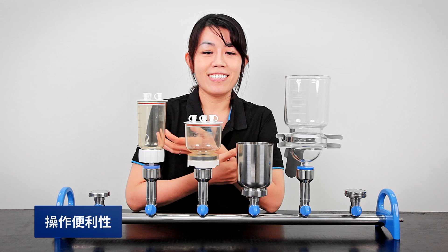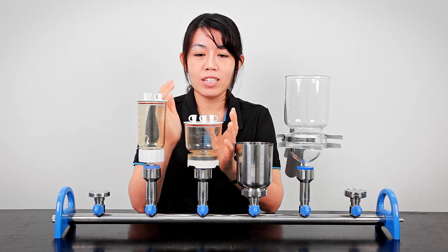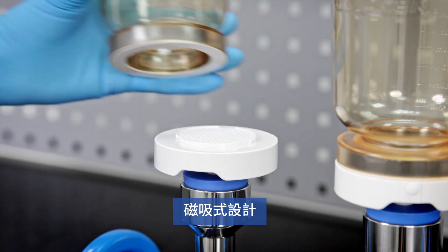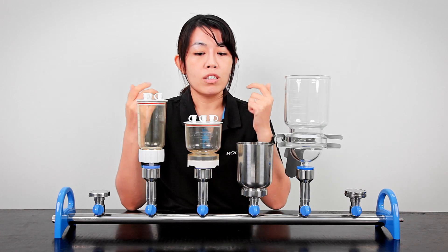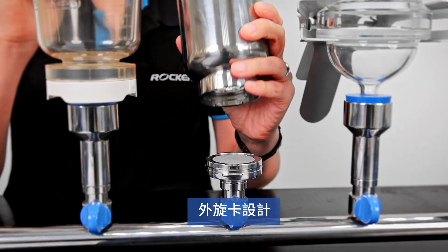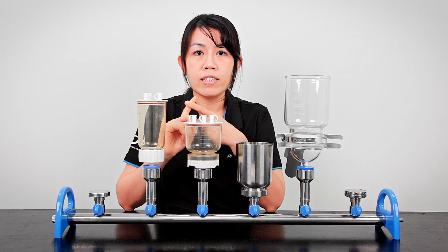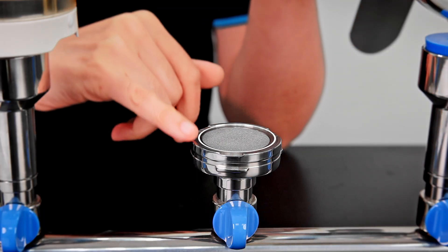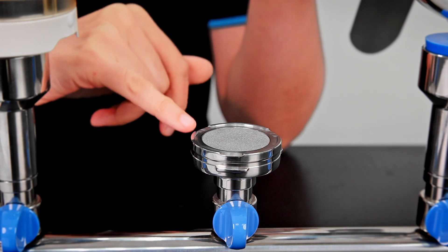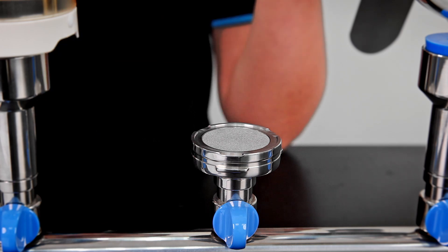Last but not least, handiness — which is a bit subjective. For me, the first place definitely goes to the MF collection. As you can see, you can take it out very easily, replace the filters, and put it back — the procedure is totally smooth. The SF is also very easy to use: with its spin lock, a slight twist takes it off and you can change filters just like this. There's also a membrane guide on the holders that makes it easy to always place membranes in the center, and three small cuts that allow you to use forceps to take the filter out without damaging its edges.